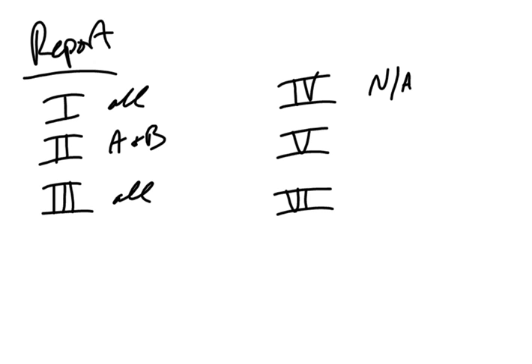5 is a calculation, so you're going to do the calculations. I'm talking about all calculations here: the calculation of determining the mass of the calcium chloride that was in that known molarity of solution, and the calculation of the theoretical yield.